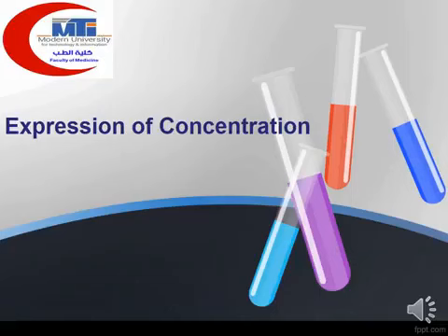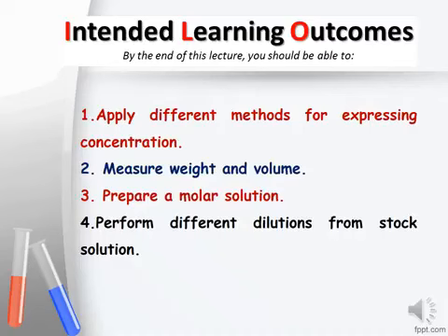First, expression of concentration. What are the ILOs of expression of concentration? First, we are going to determine how to apply different methods for expression of concentration. Then, we have to determine measuring weight and volume, preparing a molar solution, and performing different dilutions from stock solutions.